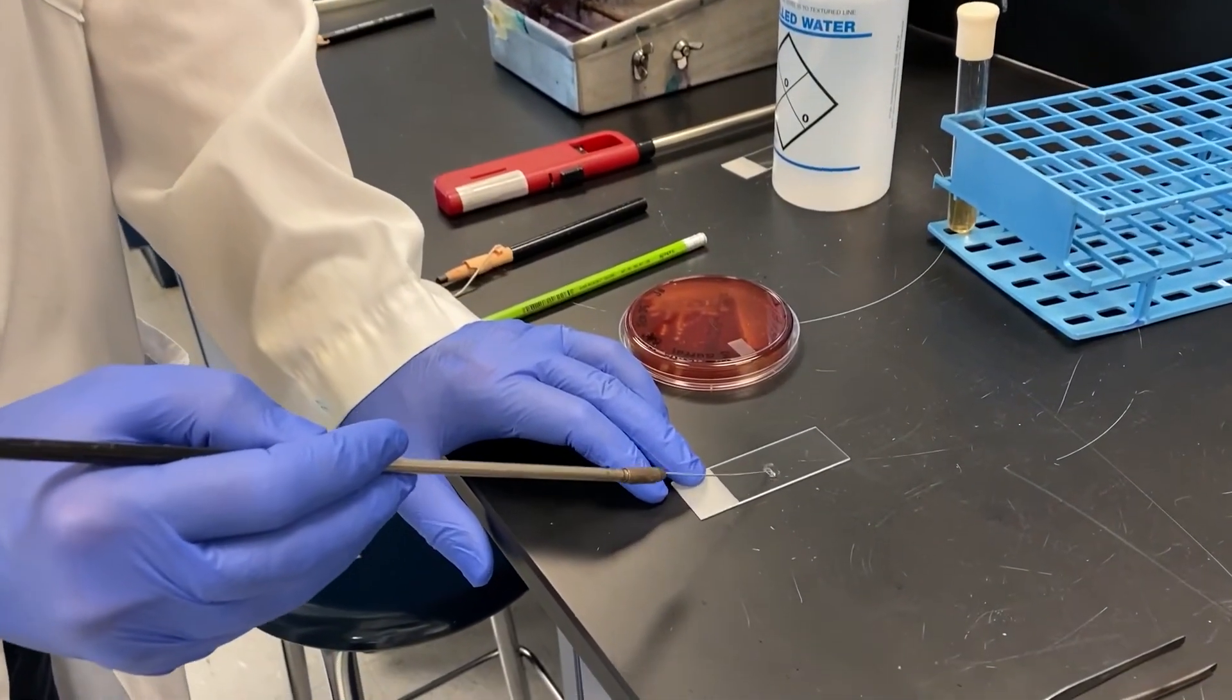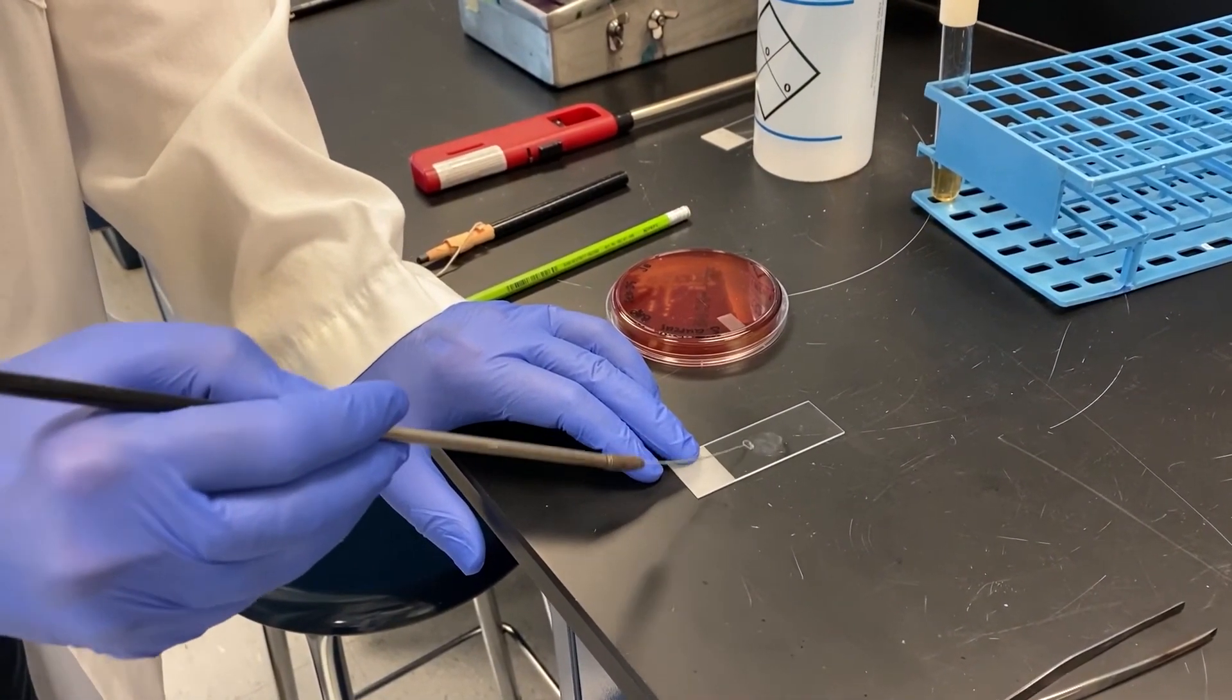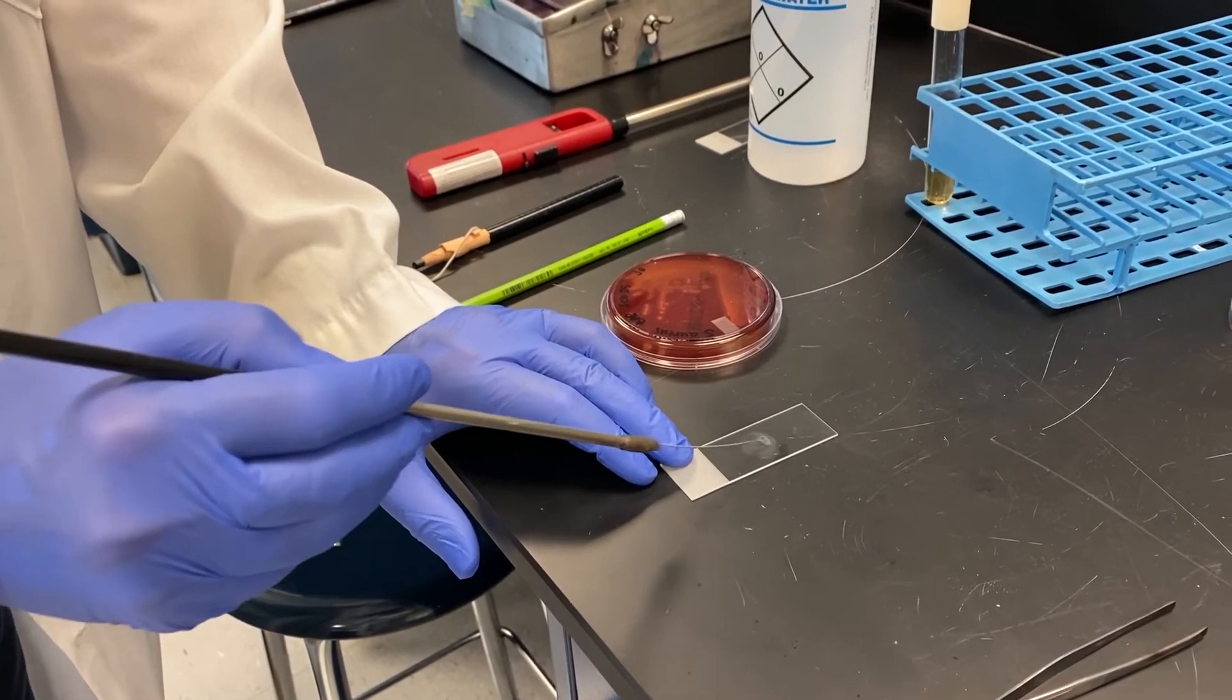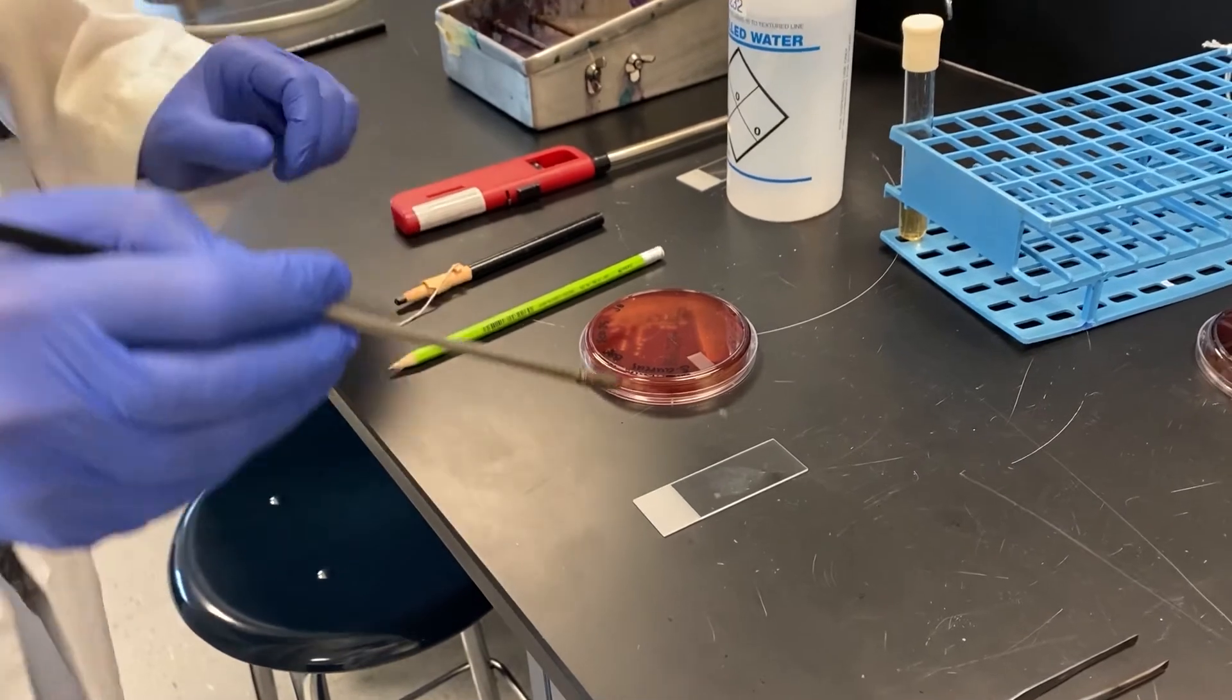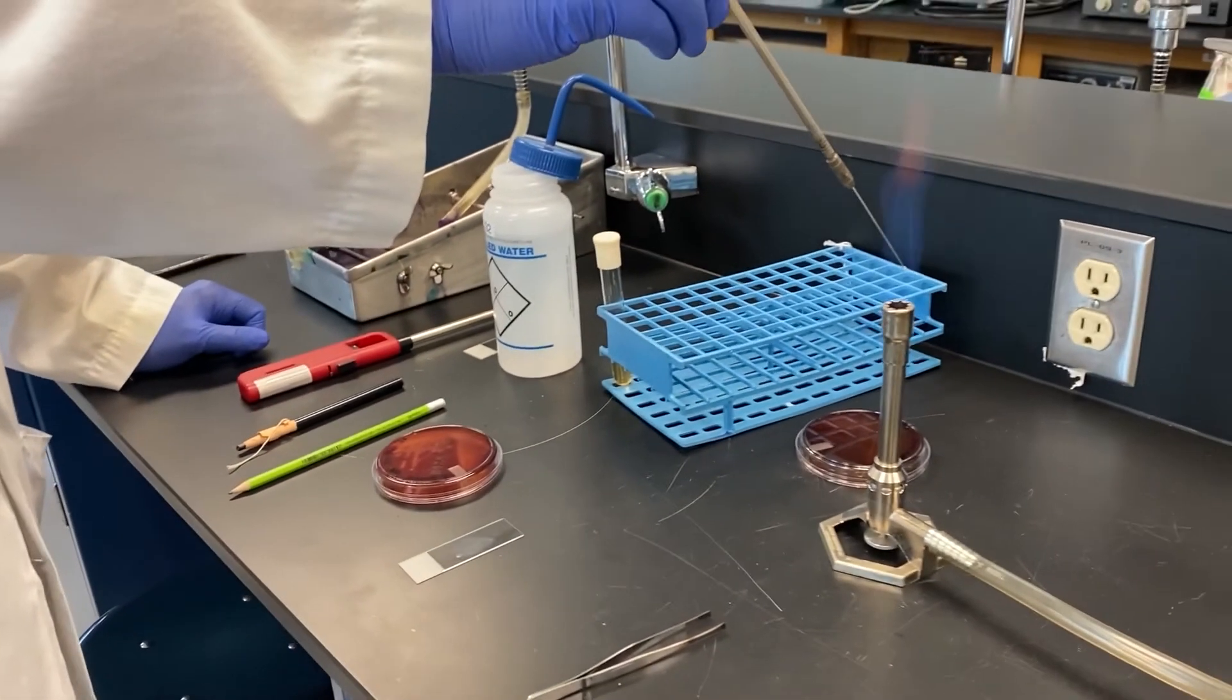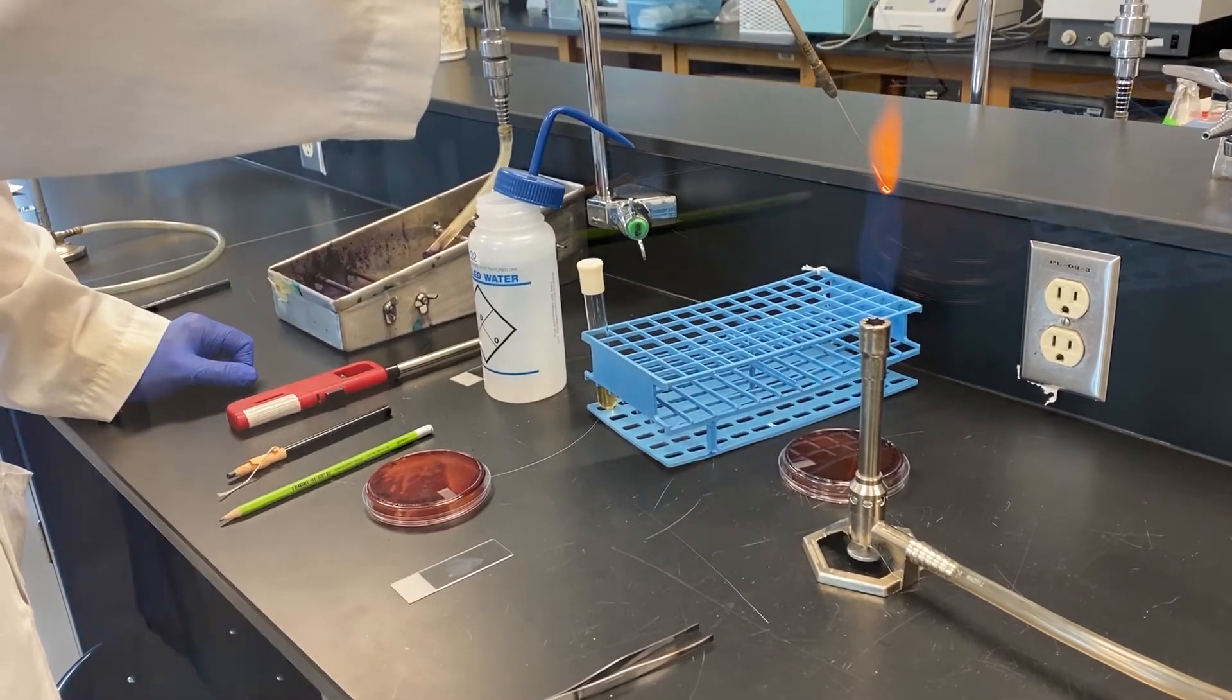Once you have your colony picked up mix it with the loop full of water that is already on the slide. Notice, unlike when preparing a smear from a broth, there is no need to draw a circle on the slide. Bacteria from a plate are much more concentrated compared to a broth culture and you can easily see the milky smear without any extra markings required.